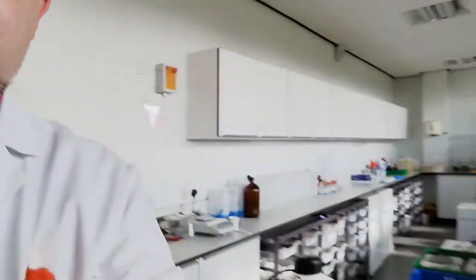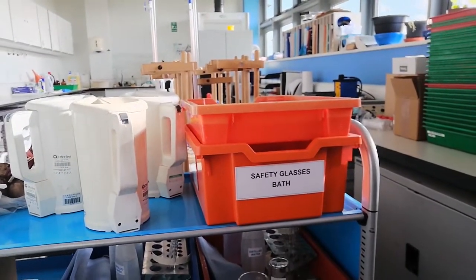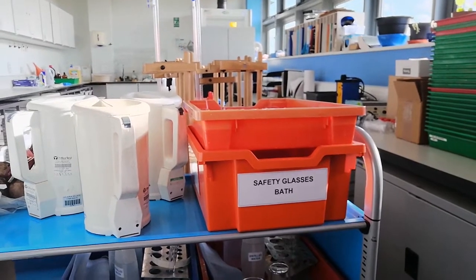Technicians always come up with ways to make things work. Technicians make things happen. So here we have our deep gratimel tray ready for our safety glass bath.